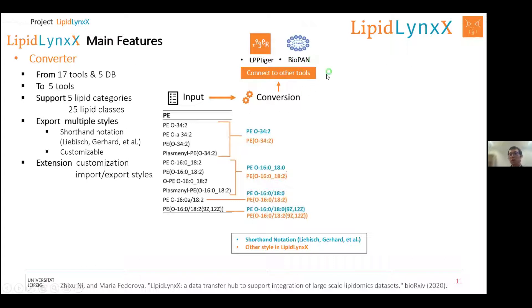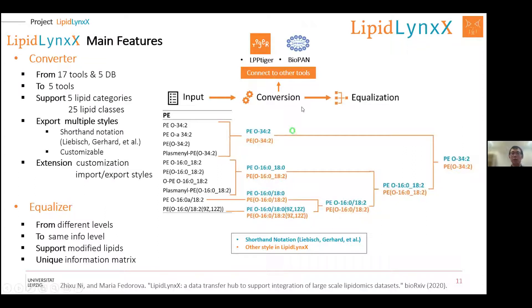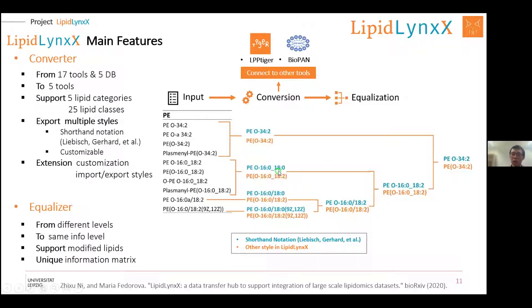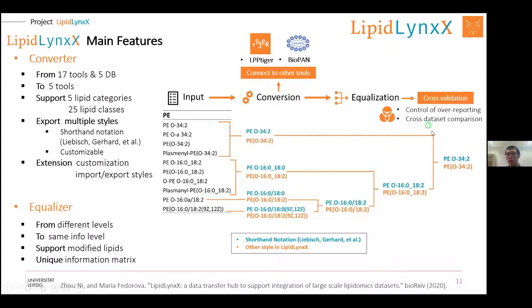The Equalizer function allows cross-comparison. For example, one entry may have double bond information and another may not, but we can say they are comparable. One entry may have SN1/SN2 position information and another without — we can say this one can be compared with that one. It is the sum composition of carbon number and double bonds, and this is a subspecies of that one. Based on this hierarchical tree, we can equalize them together and make cross-validations of different data sets.